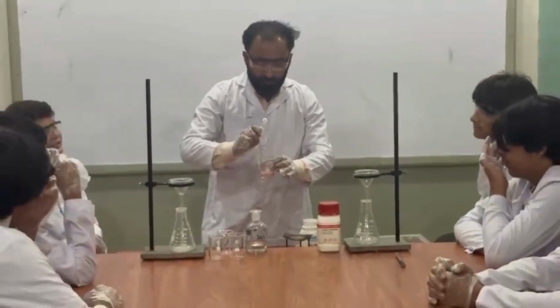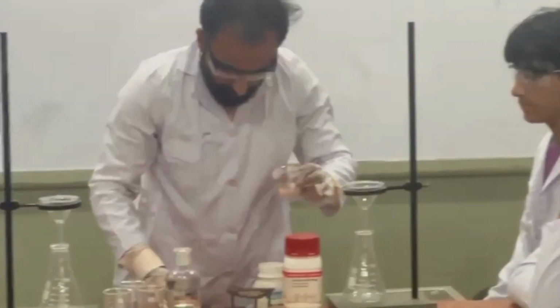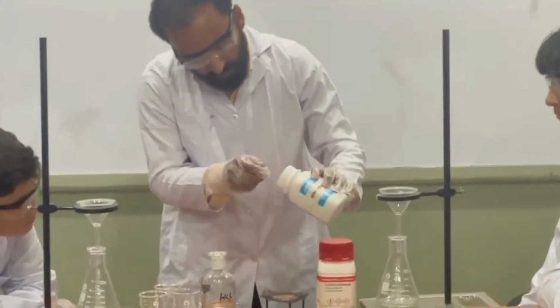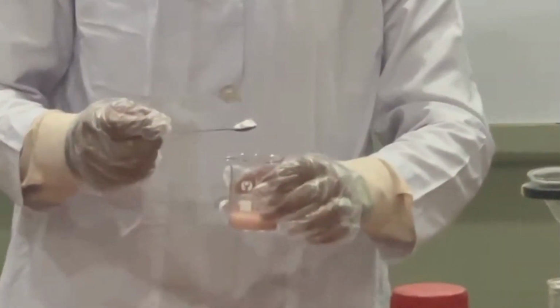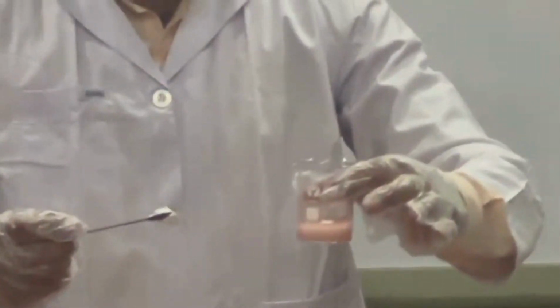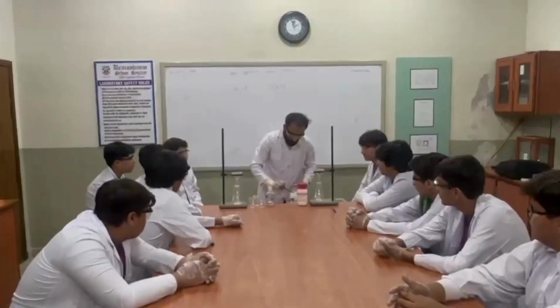That's great. And I would like to add some more zinc metal, and I will observe whether the reaction is taking place or not, because we have to do this till the end of the reaction. Now the reaction is not taking place, so we cannot add more zinc metal.